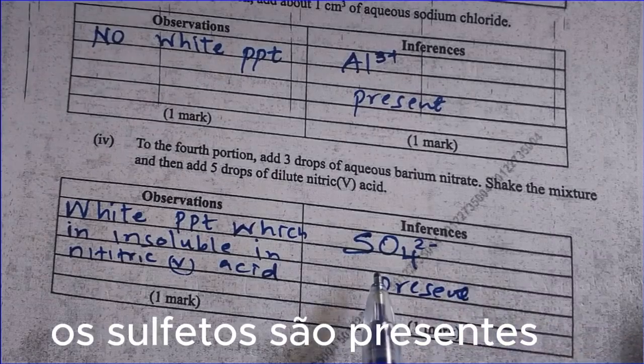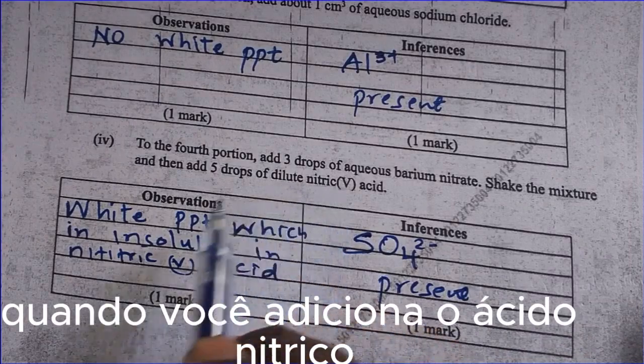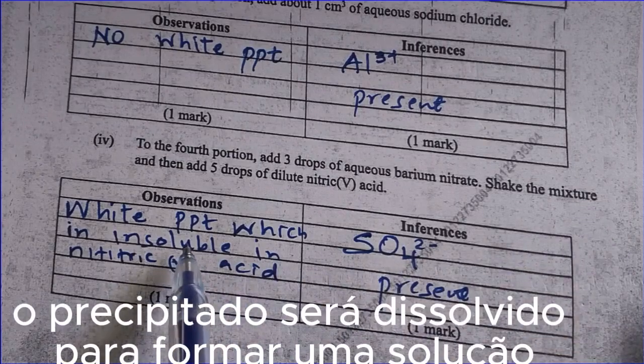The sulfate ions are present because they are the only one. When you add dilute nitric acid, it will not dissolve the sulfate. But if it was the sulfite or the carbonate, the white precipitate will dissolve to form a colorless solution.